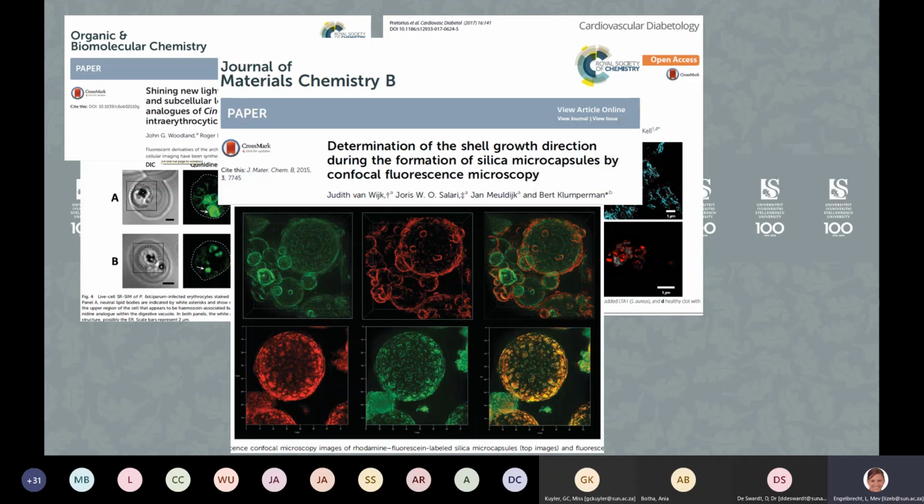It's only with super resolution that you can actually see that there was some layer in between the red and the green layer. And then they did the same thing the other way around. Red first, then green, and the overlay. Right, so this is SIM.